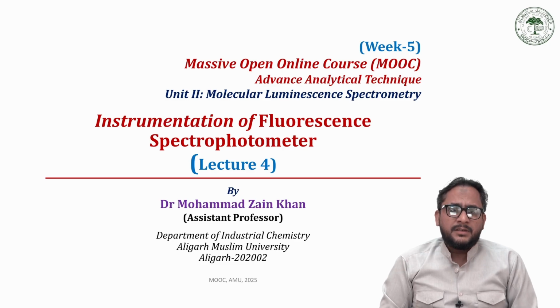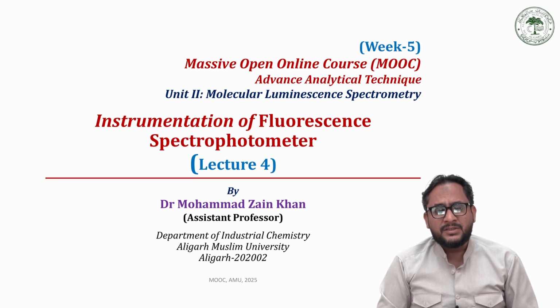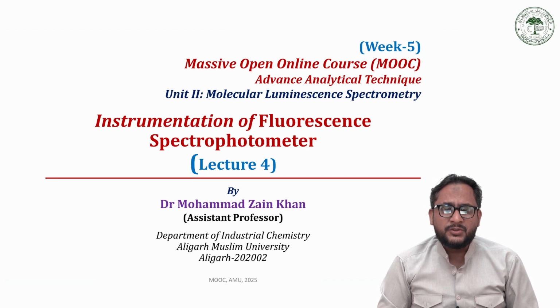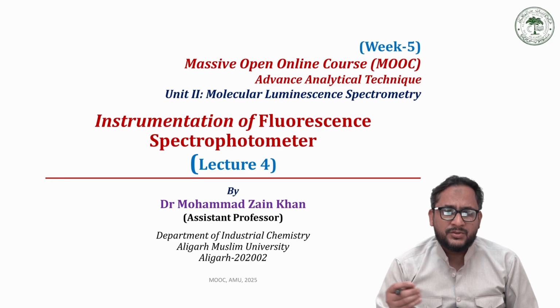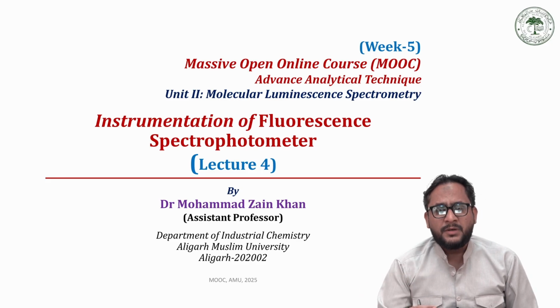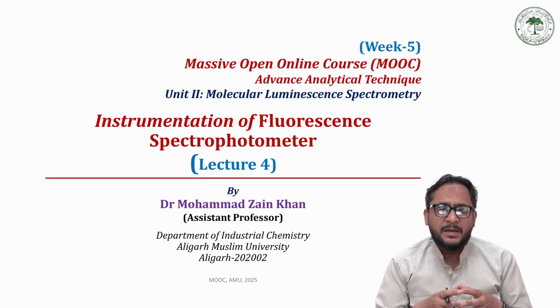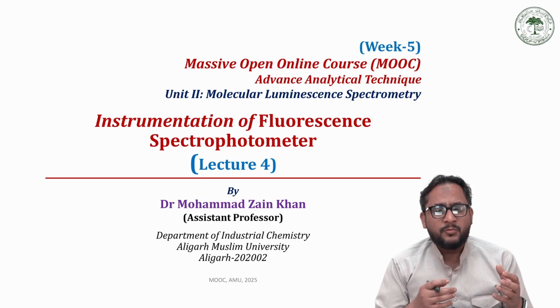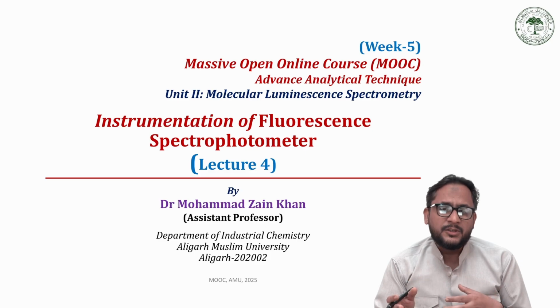In this week, as we are discussing molecular luminescence spectroscopy, in the previous lecture I explained the instrumentation of spectrophotometers, where I showed you a flow sheet and discussed how light radiation is passed through a monochromator called the excitation monochromator, then interacts with the sample, again passes through a monochromator and falls on the detector for detection and creation of the spectrum.